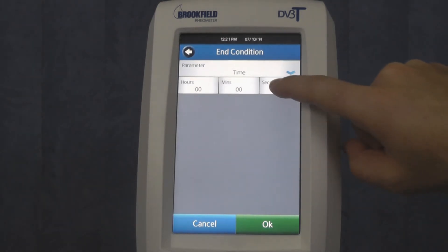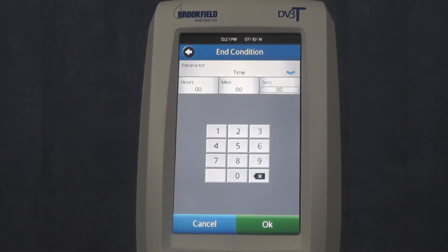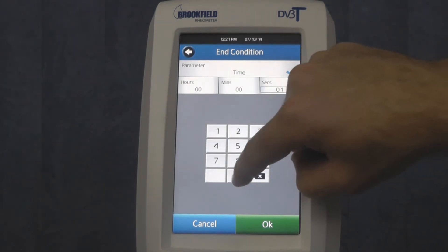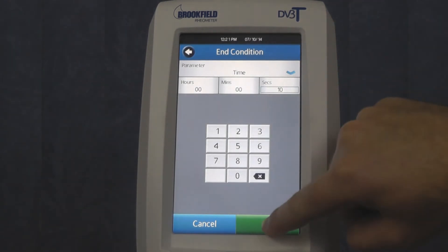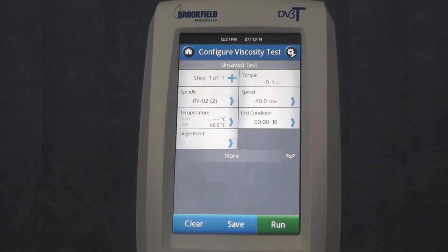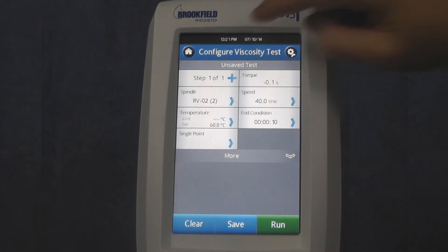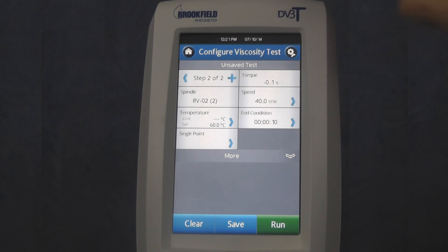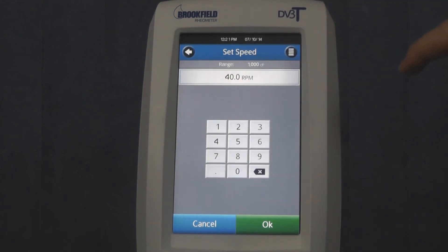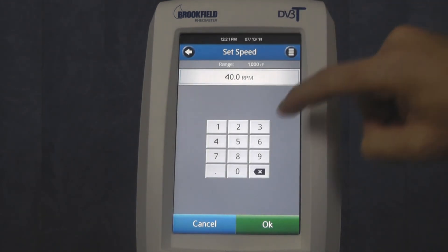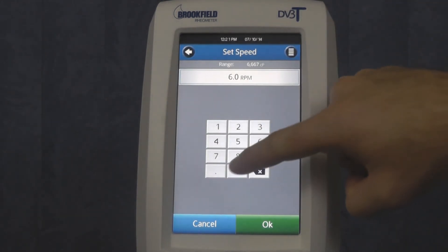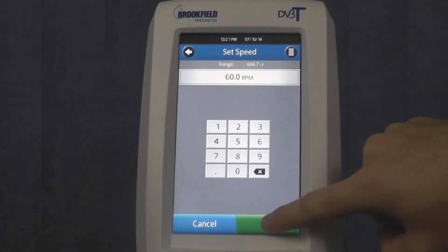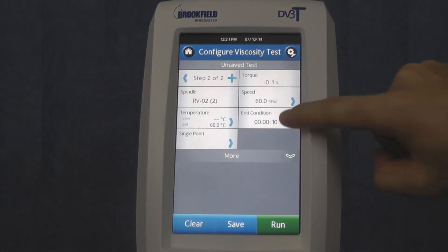You can set up a first step to have a certain speed and a timed end condition of 10 seconds. You then have to set up a second step, which would commence once the initial end condition of 10 seconds has been met. You can select a different speed for the second step, as well as a different end condition.